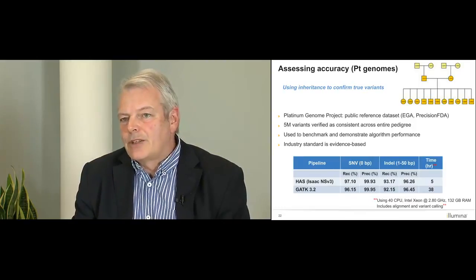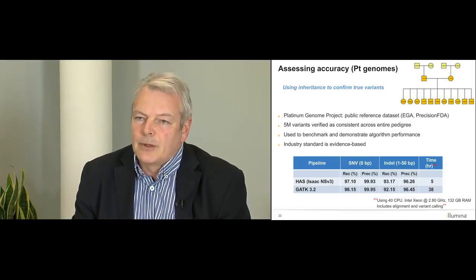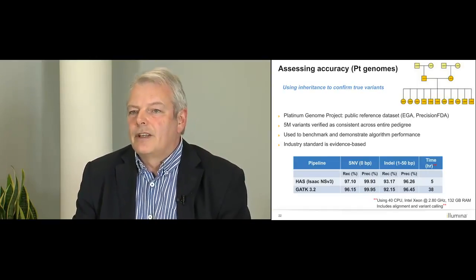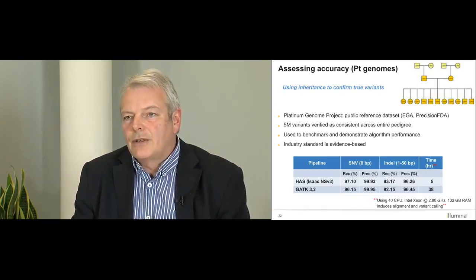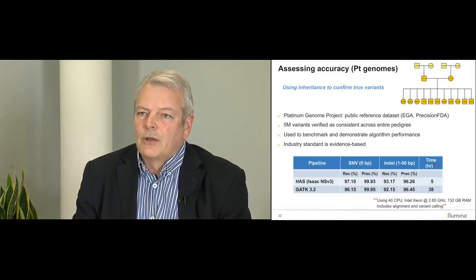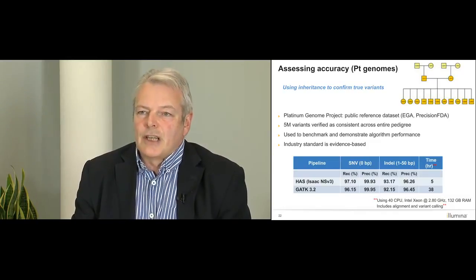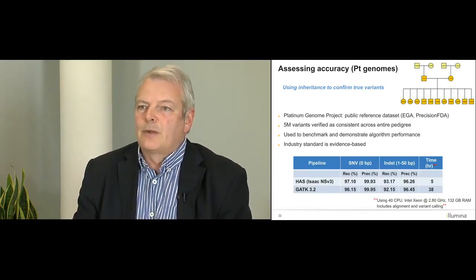And the bottom table illustrates a straightforward comparison between the HiSeq analysis software, an earlier version in fact, the v3, and GATK. And you can see the recall and precision of either the single base substitution calls and the small indels, 1 to 50 bases, is essentially comparable. You can examine the differences between them.